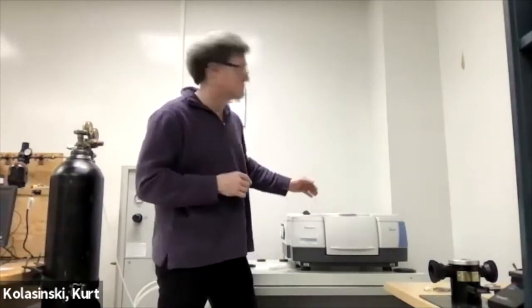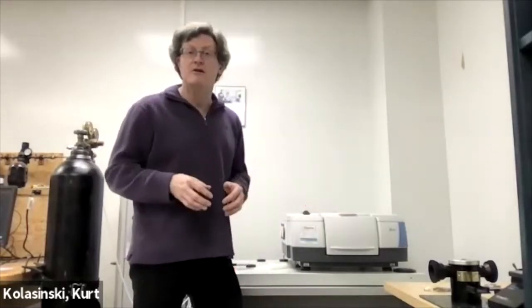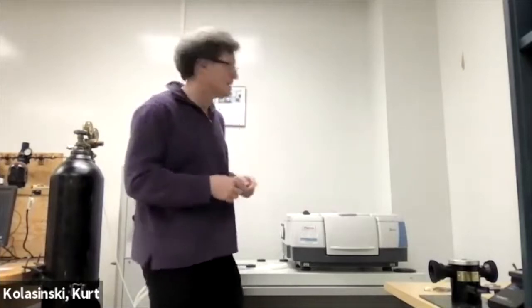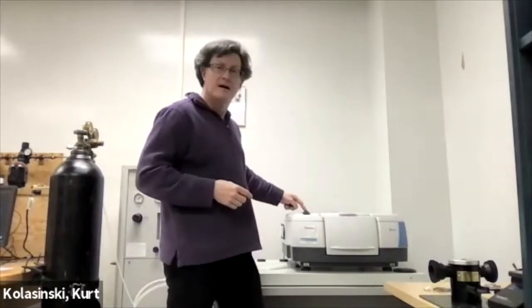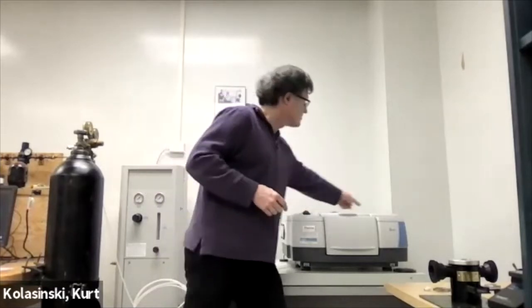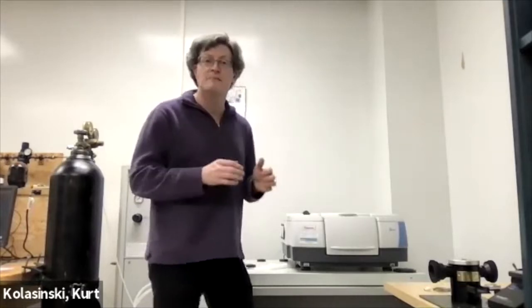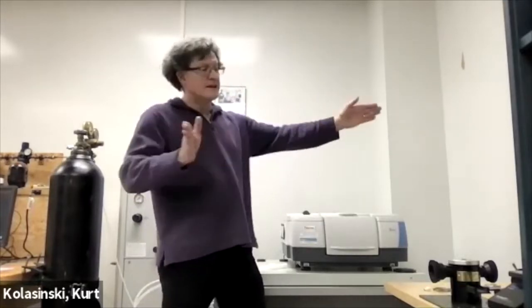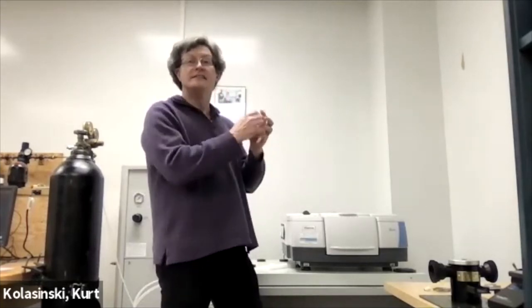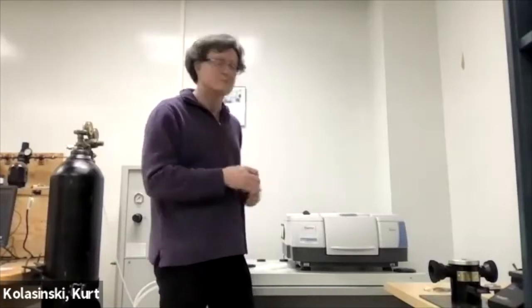And there's also a beam splitter. The beam splitter in this case, what we're using is KBr, potassium bromide beam splitter. It splits the beam into two. Why is that important? Because one path is to go through our sample, and another path is recombined with that, and it forms an interferometer, right? You have two paths, radiation coming out, and you recombine them, and you get them to interfere with each other, and this way you get a spectrum of all frequencies of the infrared light at the same time.